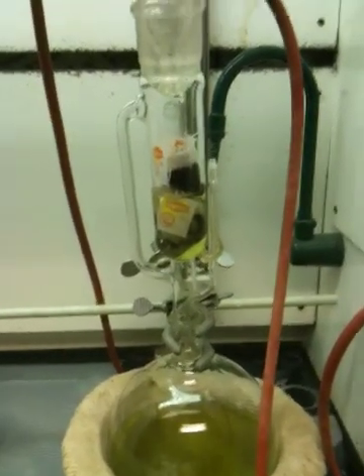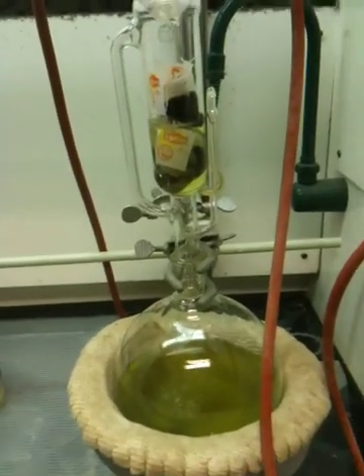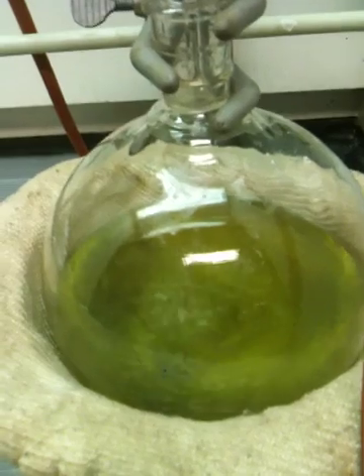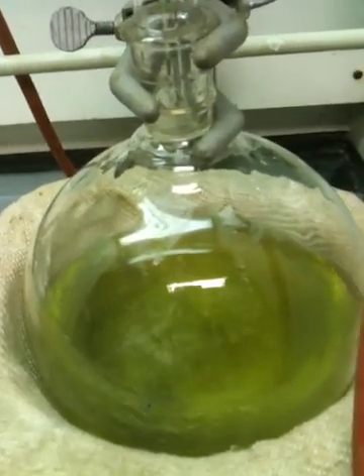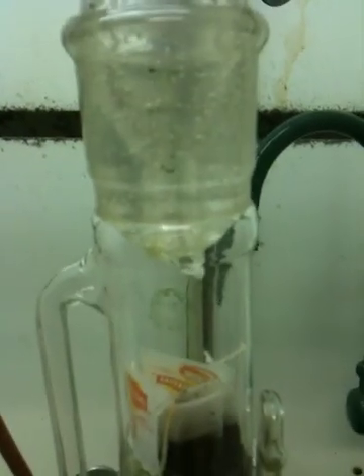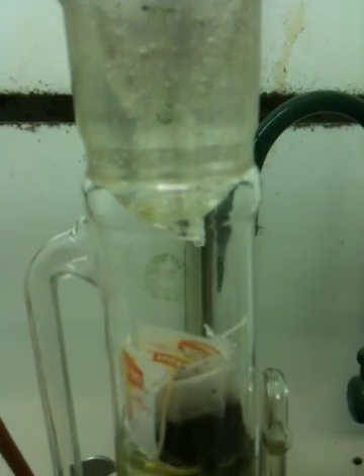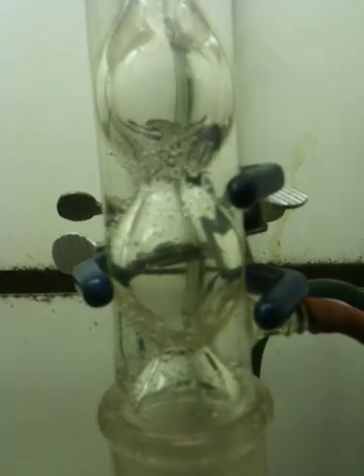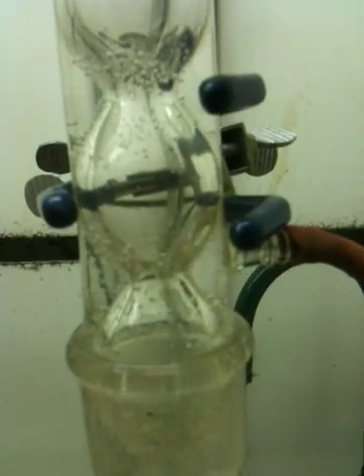Hi class. This is an apparatus called a Soxhlet Extractor. It's described in your laboratory manual in the extraction lab. What you have here is a pot with a boiling green liquid. Most of that liquid is dichloromethane. You have a chamber in which I have several tea bags into which fresh dichloromethane is condensing and dripping on the tea bags and filling that chamber. And above that I have a high-capacity condenser that's condensing that dichloromethane.